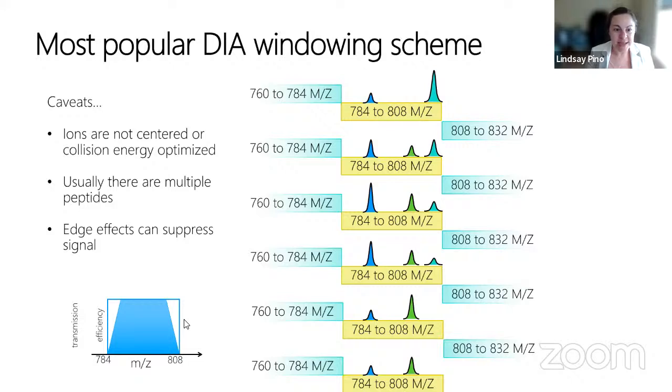So in the DIA scheme, does the software stitch together the fragment scans? It doesn't need to stitch together the fragment scans to ID the peptides. A lot of DIA software will look directly at the fragment ion scan and analyze it from there. So you don't need to use the chromatogram to ID the peptide. You're still doing the identification, the detection, at the MS2 level.